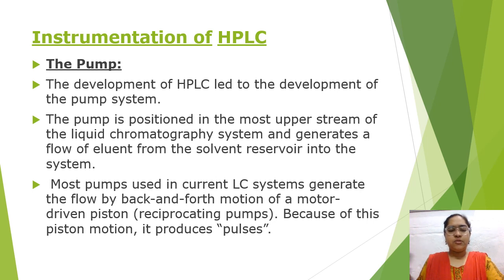Next, most pumps used in current LC systems generate the flow by back and forth motion of a motor driven piston. Because of this piston motion, it produces pulses. So it has a motor driven piston mechanism, and due to this mechanism it produces pulses.